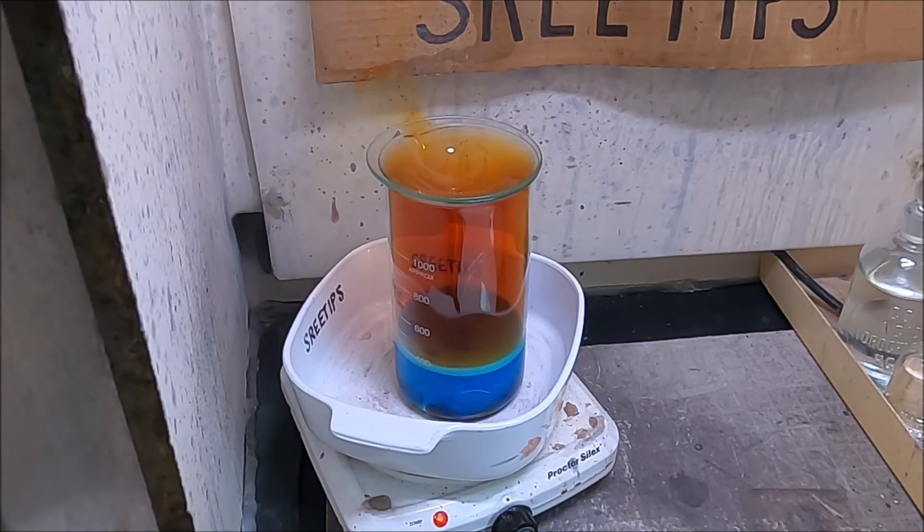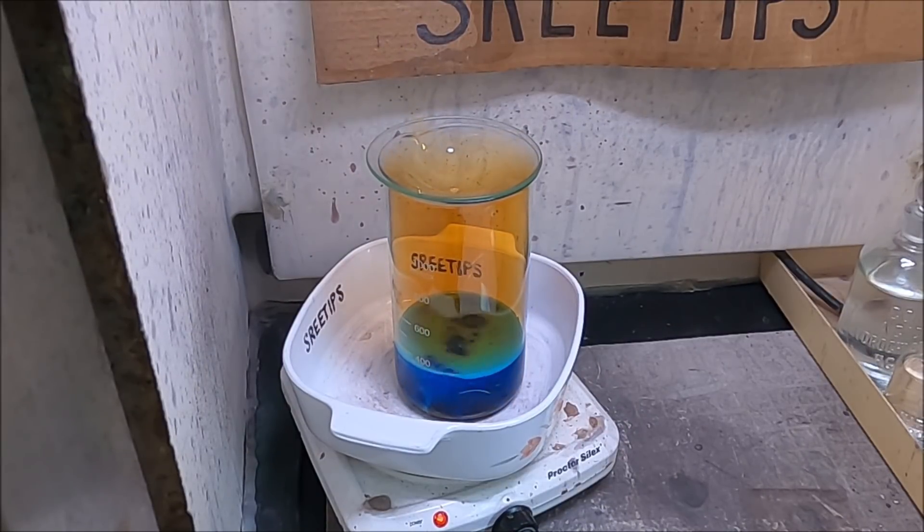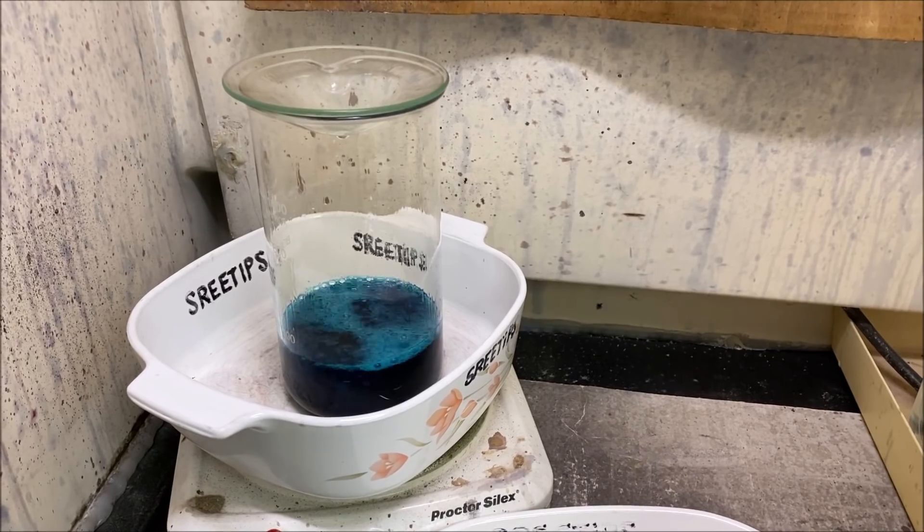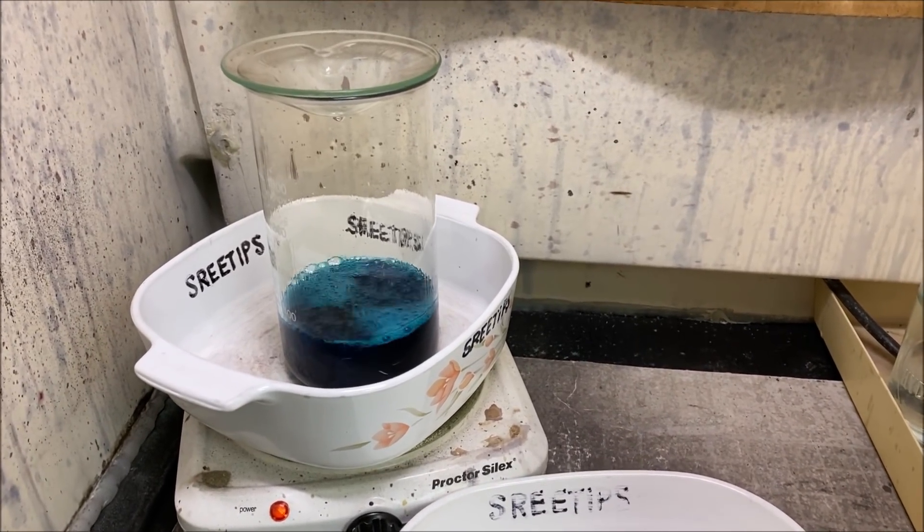It takes more nitric to dissolve copper than it does silver, so we may have to do a few additional nitric boils to get all the copper out of our gold. This reaction is complete — you can tell by the lack of fumes. I need to pour that solution off.